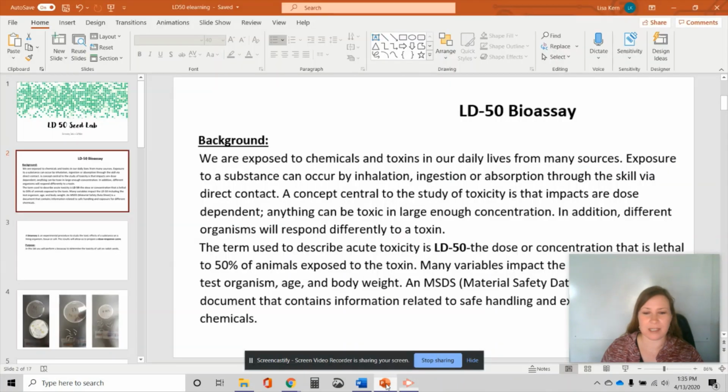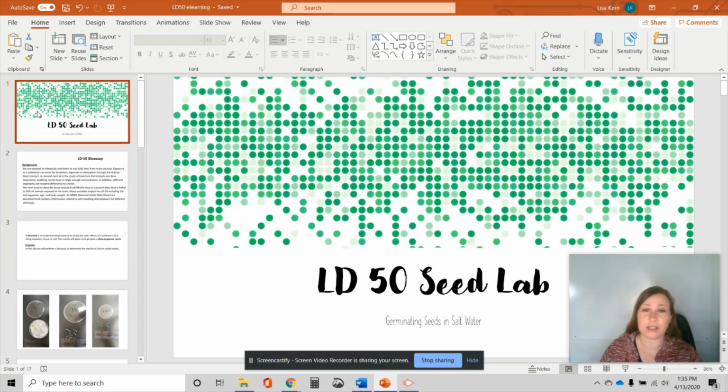Hi, I wanted to take a little time today to talk about that LD50 lab that we did before we went on this hiatus. We started preparing the Petri dishes with the seeds, and then we were supposed to come back on Monday, March 9th or whatever, and record our data, and then you were supposed to do the lab after that. So I went in and took pictures of all the data to give you the opportunity to maybe make something useful out of that.